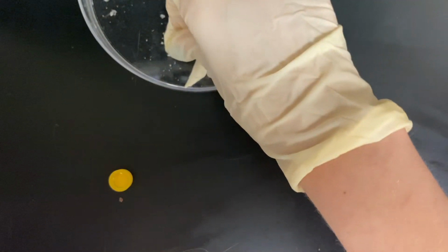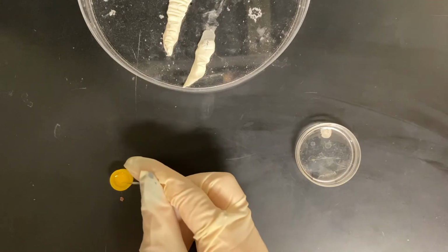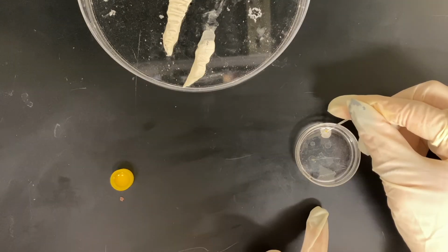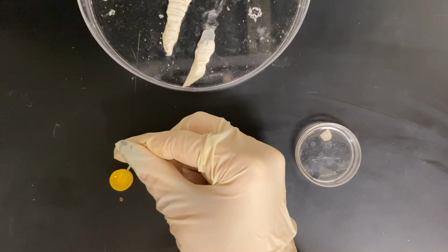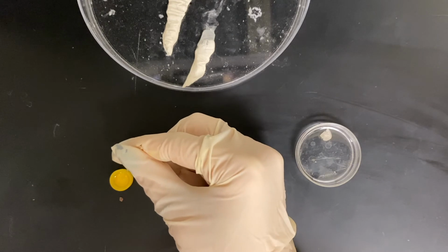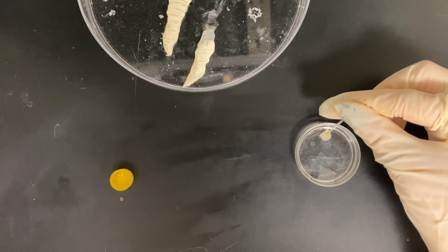I didn't want to change so much for this round, so I followed pretty much the same protocol. The only difference here is that these tissues are a little fresher. I also let it sit for closer to 12 hours. This increased amount in both time and dye was to really help me reach my goal of staining a full axon.